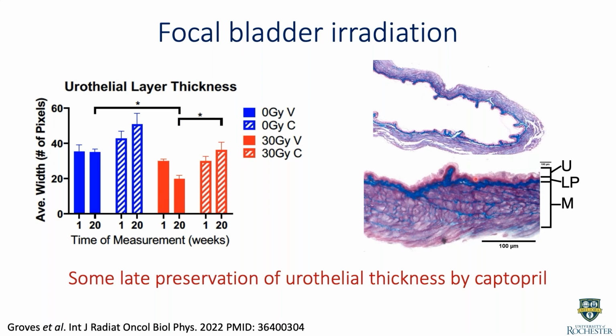And this image here, looking at trichrome stained bladder, and we're measuring the response of the tissue layers in that urothelium and muscle layer.